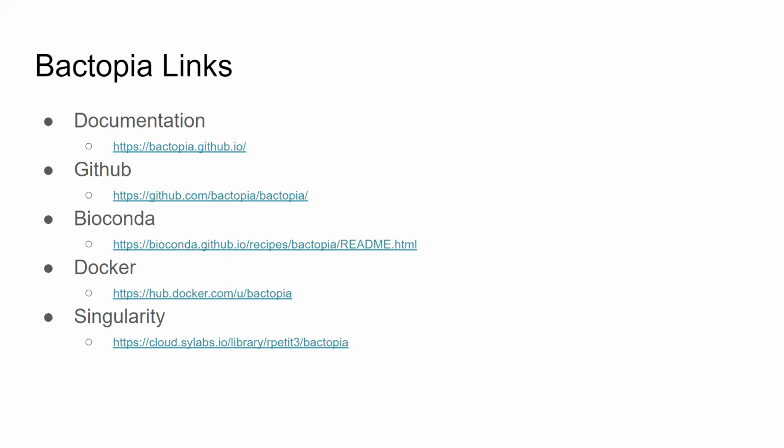In this case, feasibly, I'm thinking we could use Bactopia to just get all the reads from NCBI for that pathogen of interest, maintain that Mash database, and then run that locally immediately. Is that possible? Yeah, there's nothing that would stop you from giving your own Mash sketches and all that to run these samples against.